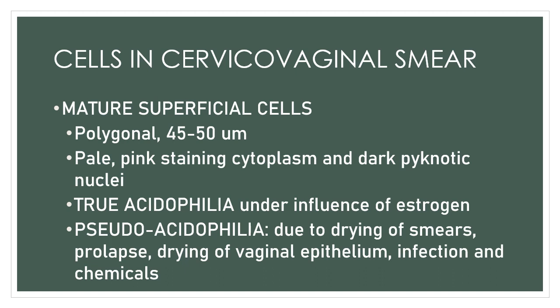Now, they exhibit true acidophilia, your mature superficial cells. True acidophilia is characteristic of your superficial vaginal cells under the influence of estrogen. But this is what we call a not reliable index of maturation.